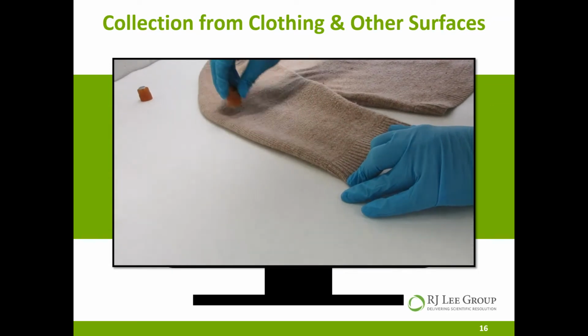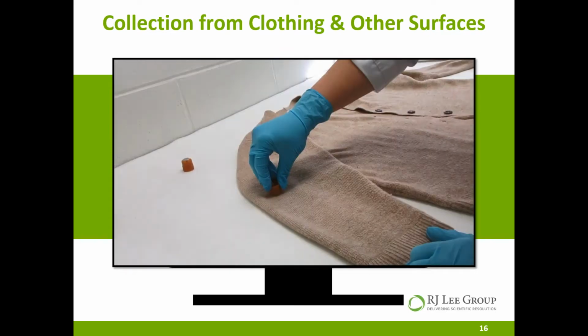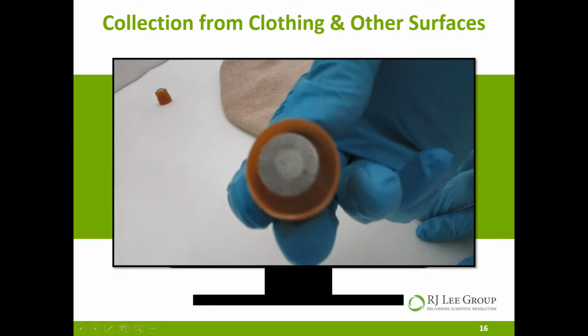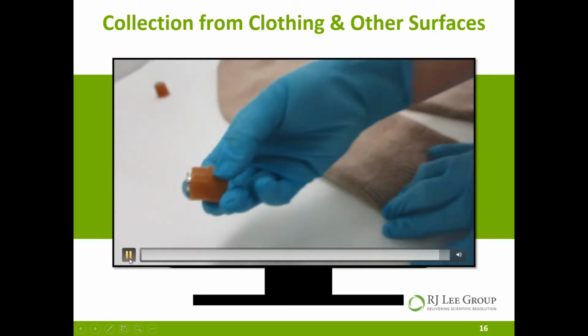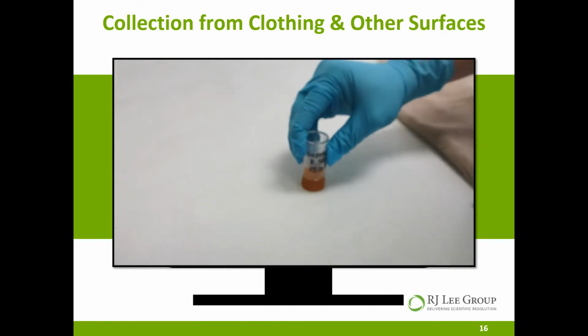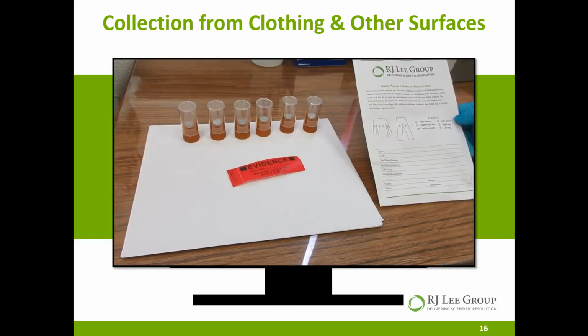Again, you don't have to push very hard. You can see that it's still very sticky. And I'm going to do an example right here. I just pushed down to show you just how sticky that sample actually is. So you don't have to push very hard. And again, you want to make sure to avoid any areas of debris or biological material like blood. Okay, so then you just continue on with the rest of the garment.